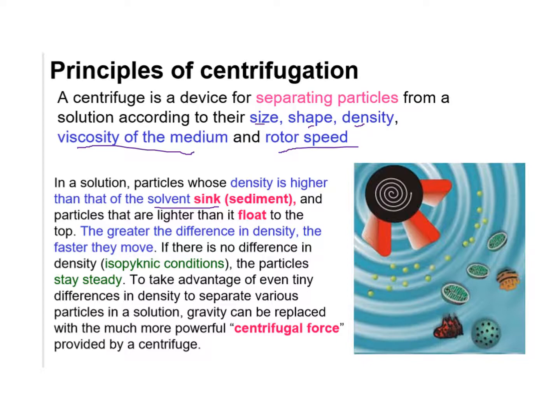Particles that are heavier will sediment towards the bottom, and particles that are lighter will float on the top, right? Oil floats on the top of the water, okay? A stone sinks. The greater the difference in density, in other words, if they're very dense, they're going to move fairly fast.